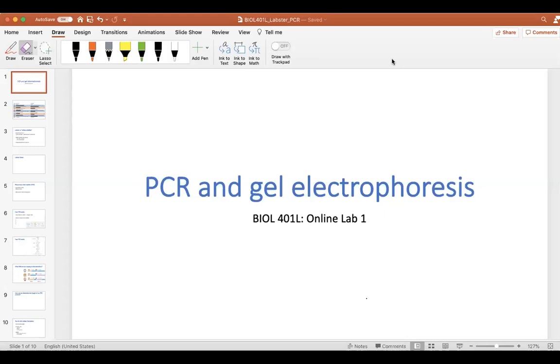Today I'd like to give you a brief video introduction into what our online laboratories will look like, and then give you some background information on this week's online laboratory, which will cover the techniques of polymerase chain reaction and gel electrophoresis. These are two techniques that are very important to the study of genetics.